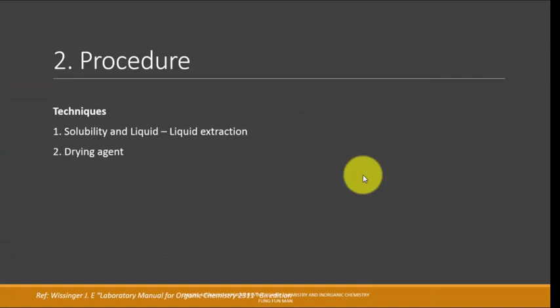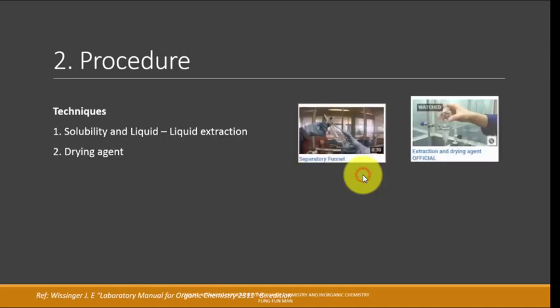Now there are two techniques again we need to revise with you here. Liquid extraction, drying agent. Right, you have done this many times in your year 1, year 2, maybe even year 3 before this. But there's no harm going through it again, revision for you. Okay, hope you have seen this video again to see what is the proper procedure, the action you have to take when you are conducting this kind of procedure.